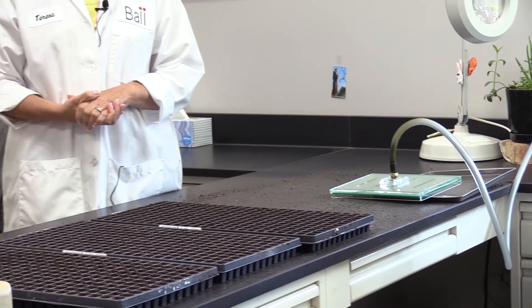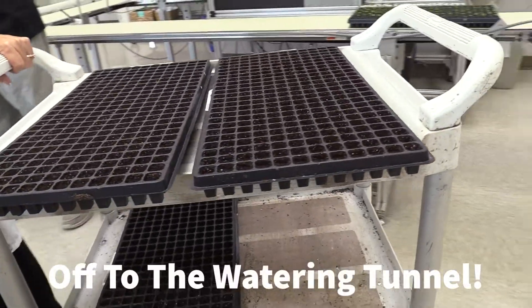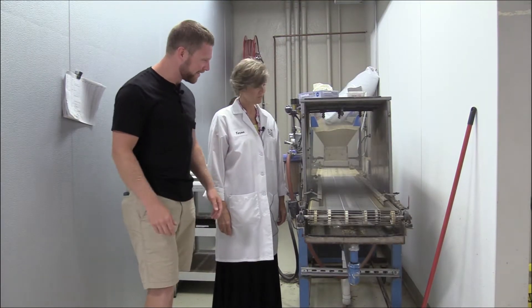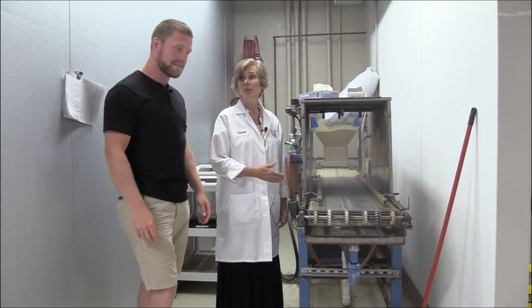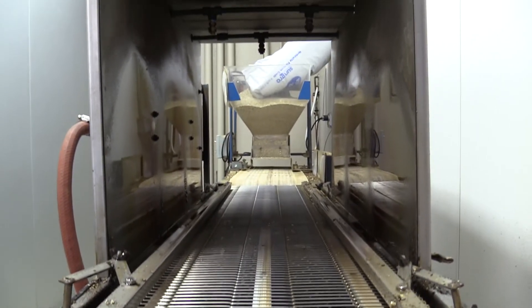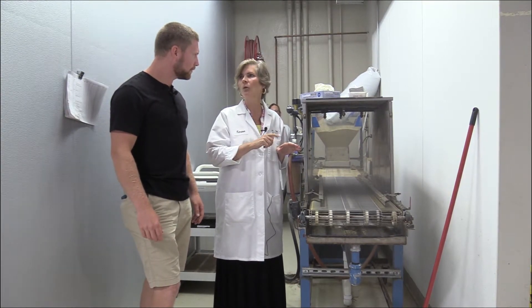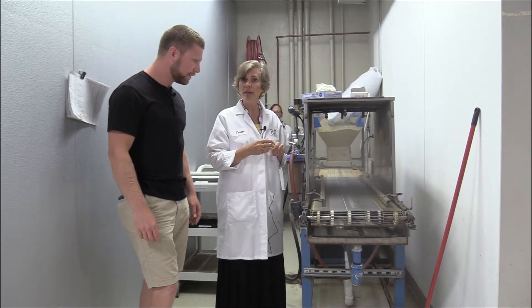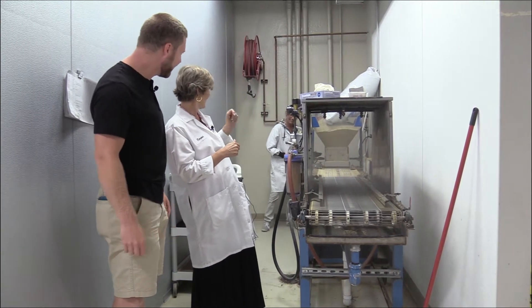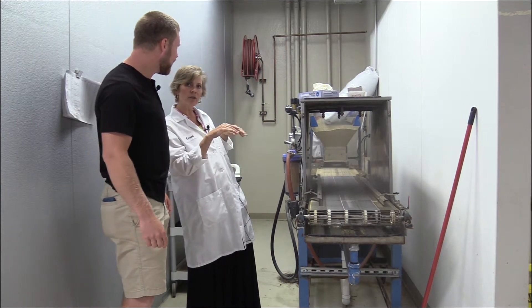We definitely need one of those! Okay, Teresa, what is this thing right next to us? Well, this is a watering tunnel. After we do our sowing, we have to go ahead and water in that flat. The most important thing when we're sowing and doing tests is to get it watered in properly. So Danielle's going to put the flat through here — it's going to get a cover of vermiculite.